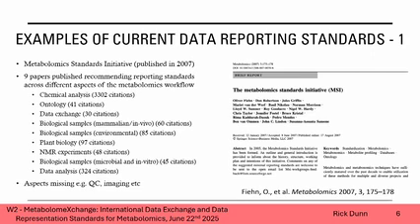But the Metabolomics Standards Initiative. So all of these were published in 2007. The Metabolomics Society came together at that time, and they published 9 papers on different aspects of the experimental process, from the chemical analysis, thinking about the experimental design, the biological samples, how we performed the analysis, etc., and the data analysis as well.